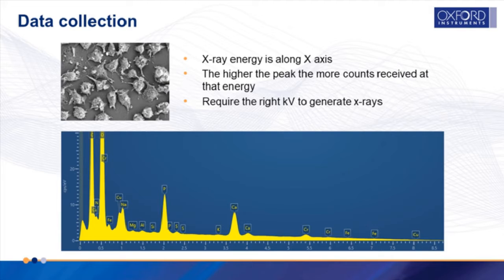You can see that sometimes there are several peaks from the same element. That is because you can get a variety of electron interactions in the specimen on different layers, resulting in the release of X-rays with several different energies. But this can only happen with heavier elements. The range of X-rays produced from light elements is restricted, and they are usually clustered at the lower energy range.